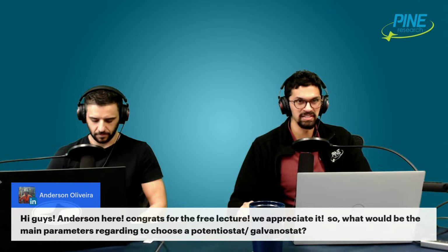And some of those things, like, what was it, common mode? Yeah, there was something about common mode where I'm like, what is common mode? Or electrometer specifications. Like, what is the electrometer? Now we know a lot more about what an electrometer is, but what does it mean when you see an electrometer has 10 to the 15 ohm impedance? Well, what does that mean? So this kind of helps a little bit with understanding those things. I think those are the questions that we have thus far.